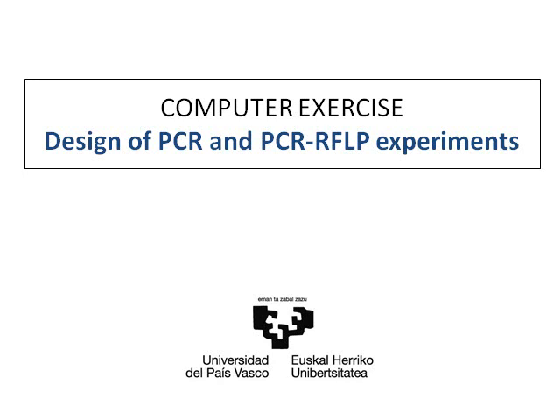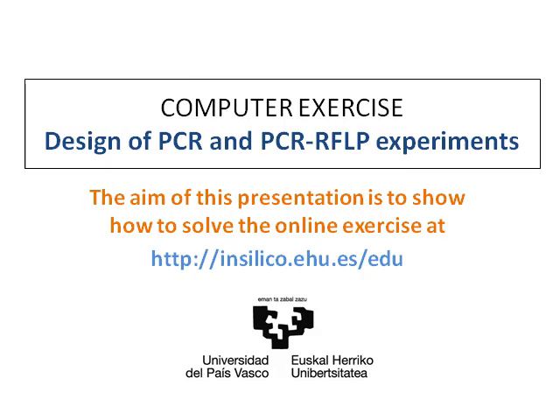Computer exercise. Design of PCR and PCR-RFLP experiments. This presentation will show how to use the online exercises on the In Silico website.